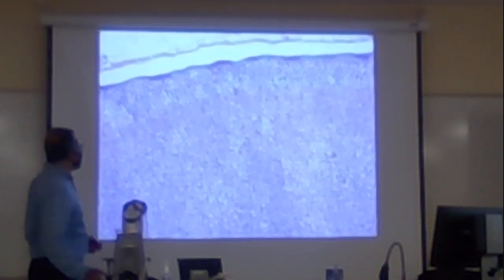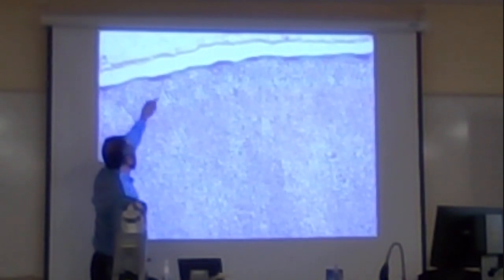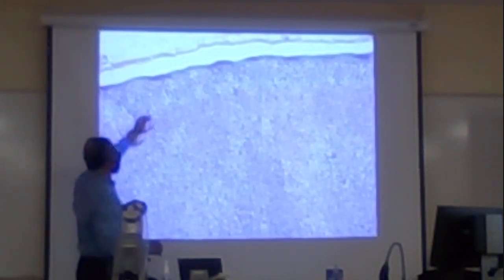You can zoom into this. Go all the way to the top. That's where the zona glomerulosa is. You can see these are more or less circular, most like the glomerulus type. So these are ball-shaped clusters of cells. This is known as glomerulosa.